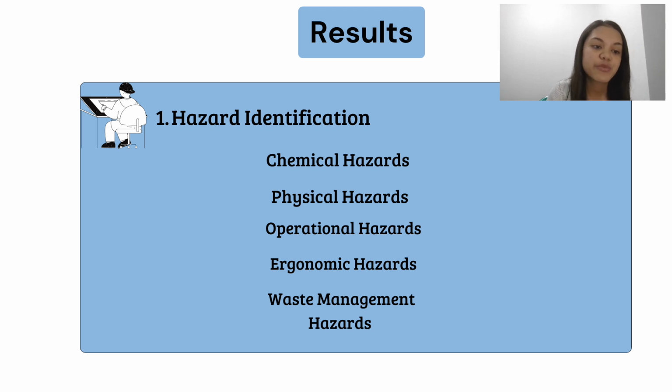And the second one is physical hazards. The physical hazards are slips and falls caused by chemical spills, or injuries sustained when operating heavy machinery. The source of the hazard is jars being dropped as a result of poor grip, and slipping on damp floors as a result of chemical spills. The control measures are to provide trays for spill control, make use of sturdy lightweight jars, and employees should be trained in safe handling techniques.